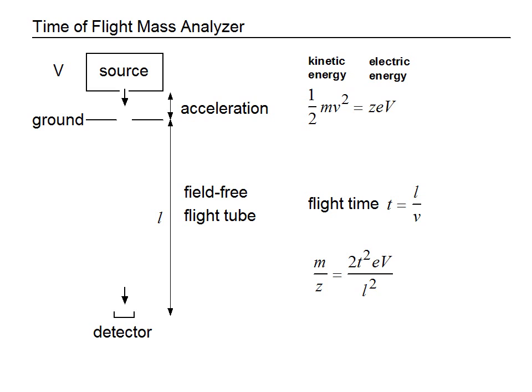This is the simplest version of the time of flight mass analyzer. As we will see later, some improvements have been made to increase the resolution. However, this is the basic relationship between time of flight and mass to charge ratio.